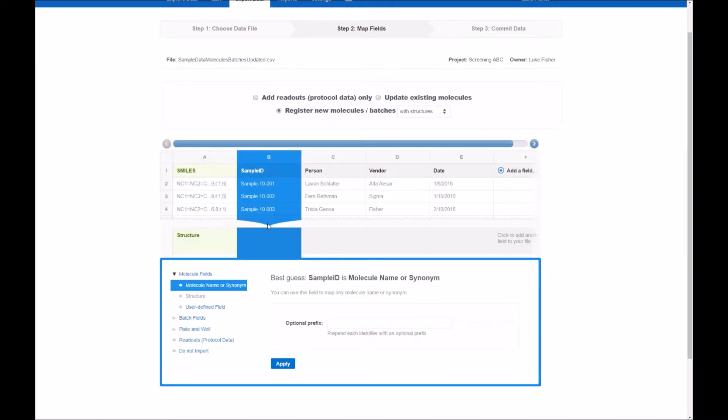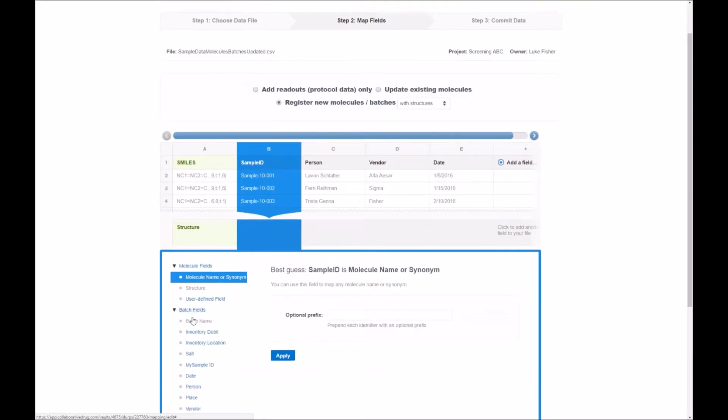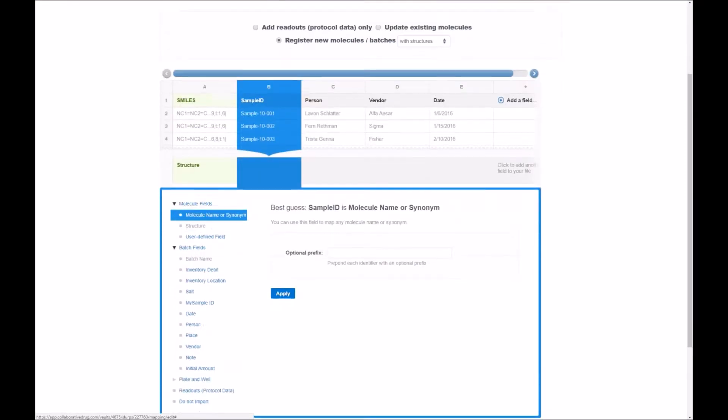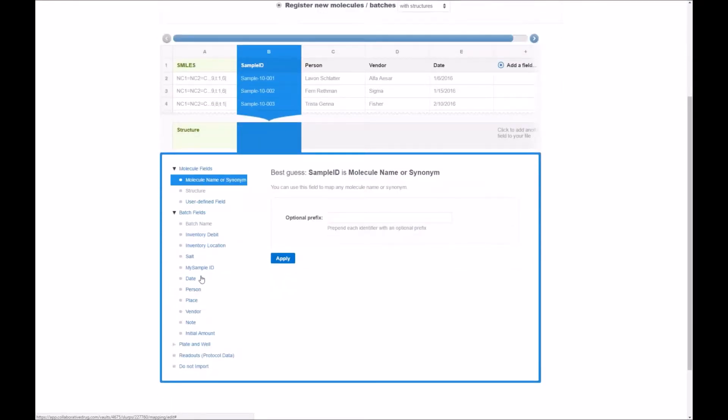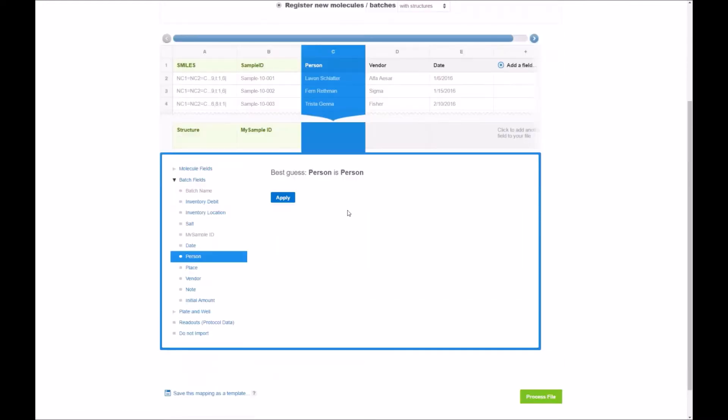The sample ID column I alluded to before, so they gave us a best guess of a molecule name or synonym. So actually there's a different batch field I want to use for this and it's underneath the batch fields pull down menu and there's an option called my sample ID. So once I select that and hit apply you see that the green is now highlighted. Sample ID maps to my sample ID.